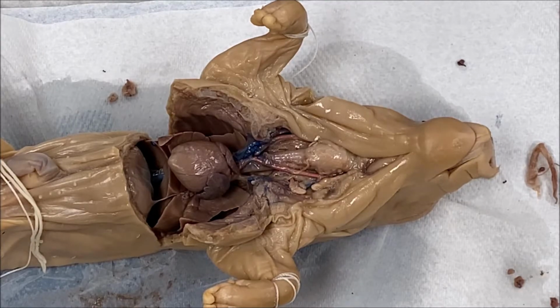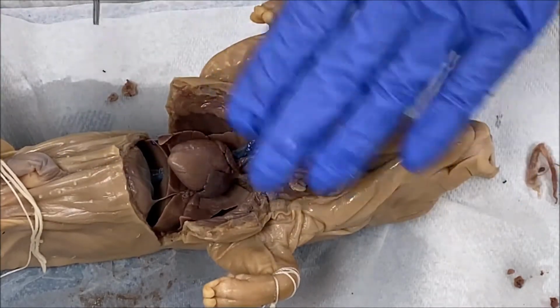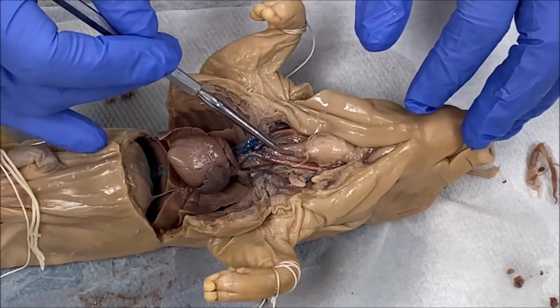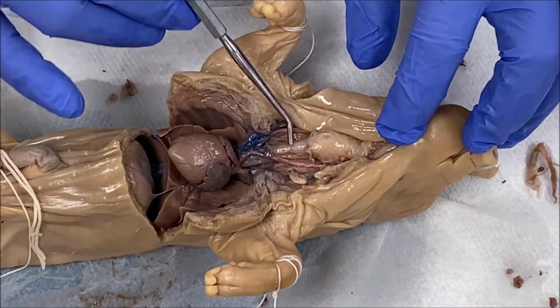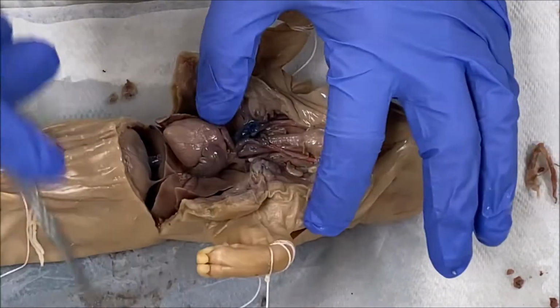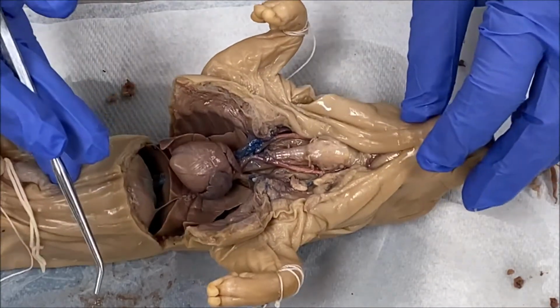The dissection of the respiratory system is very simple, because after maneuvering and manipulating the connective tissue around the neck area of the pig, you've automatically separated structures of the respiratory system, right? So here's a structure of the respiratory system, here's another structure, and then the lungs have already been dissected. There's really nothing you have to do in terms of isolating and separating the lungs, okay?